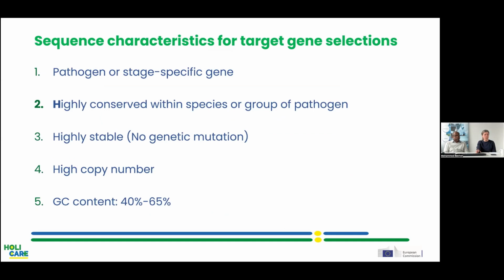Okay, so then you have to make sure that the target gene that you have identified in, for example, the literature, is really highly conserved within your species. And therefore, you can do a BLAST of a sequence of the gene.